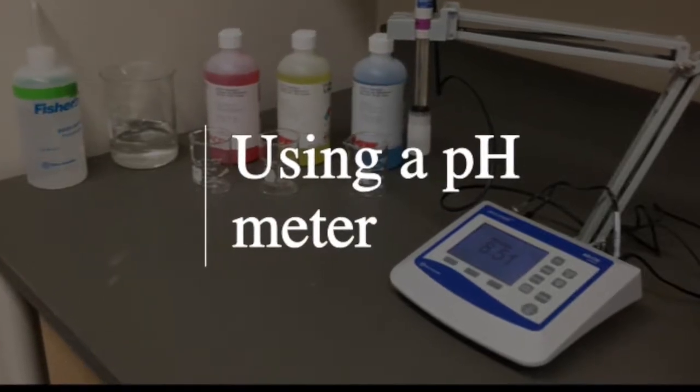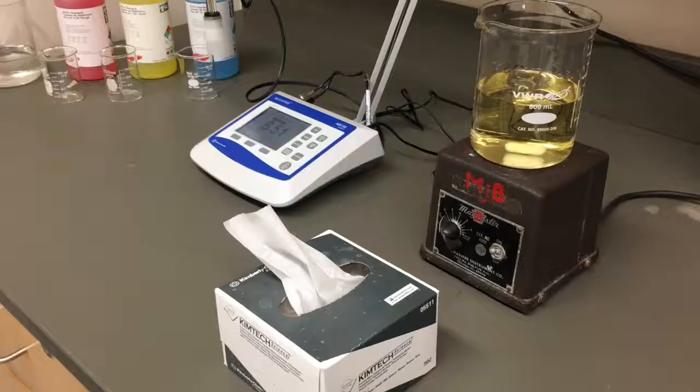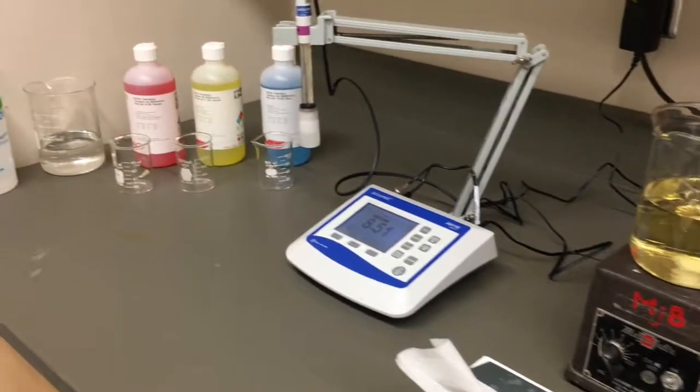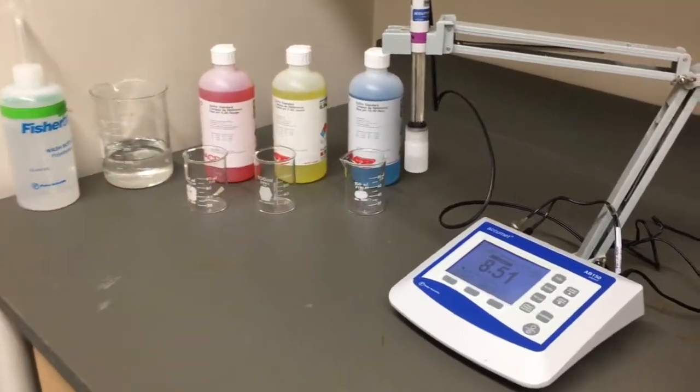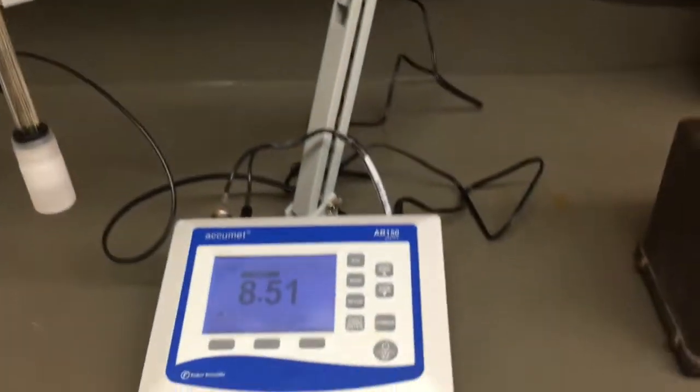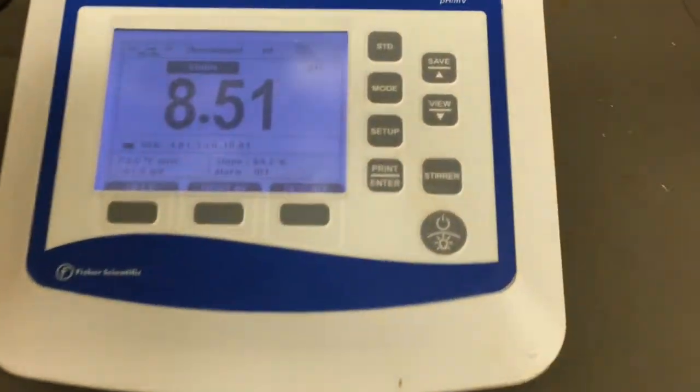This video is the general process for using a pH meter. Each pH meter will be slightly different, so consult your manual for specific instructions. We will demonstrate the general process using the Fisher Acumet model AB150.